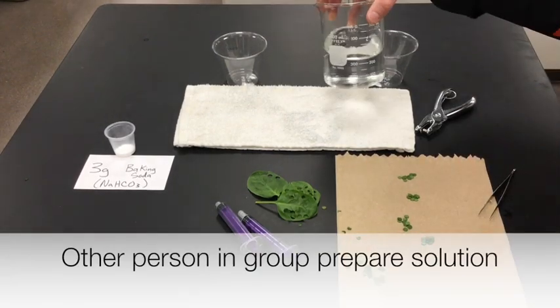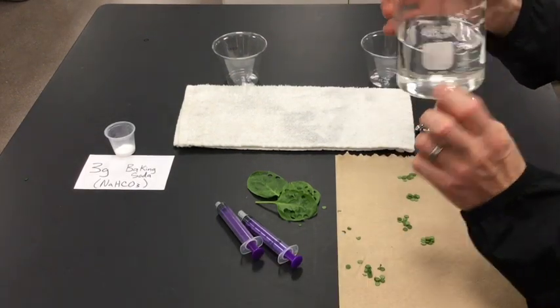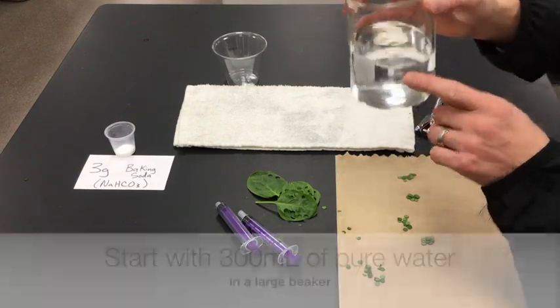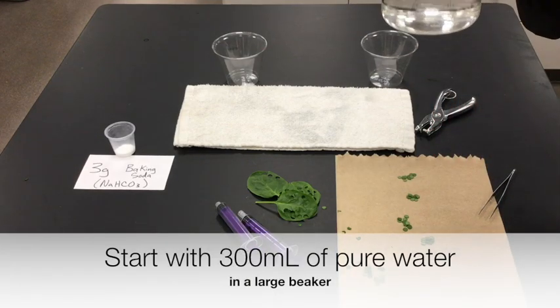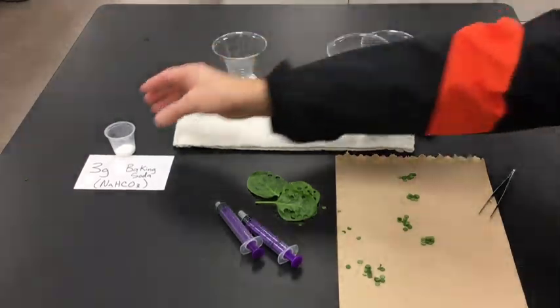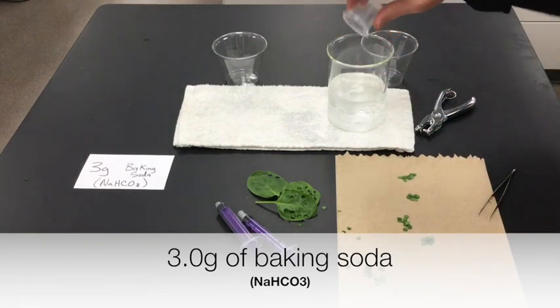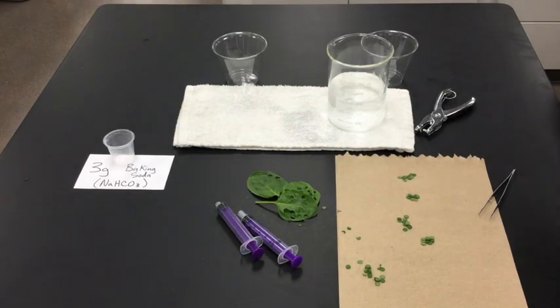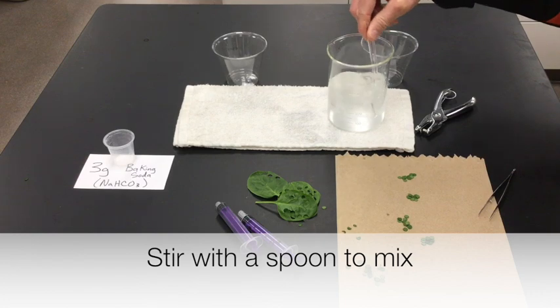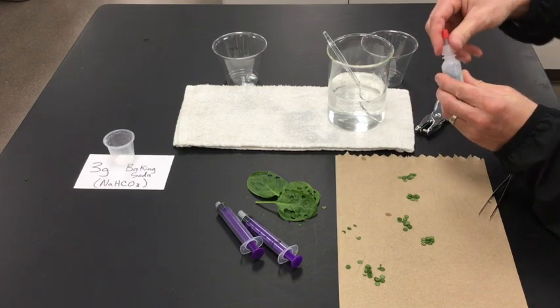The other person in the group should prepare the bicarbonate water solution. Take a larger beaker — a 400 or 600 ml beaker works — and fill it up to a total of 300 mls. Then add three grams of baking soda, sodium bicarbonate, and mix that up. Then it can be helpful to add one drop of detergent.